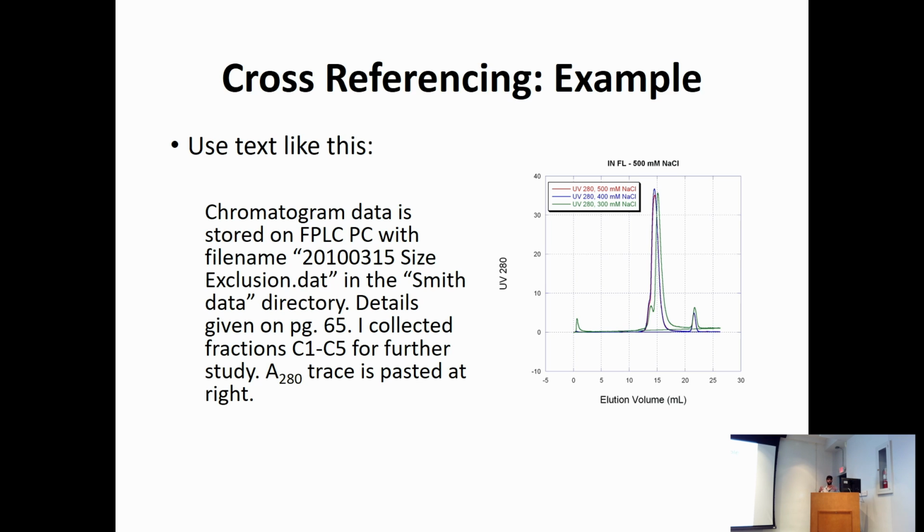Whenever he or she did the protein prep, they used the fractions from C1 to C5 for further study. All that information is there, so you can easily go through it whenever you need it. Most people are looking for the original data when it is near their submission. So it's better to know the place and have it in a specific place that is secure.